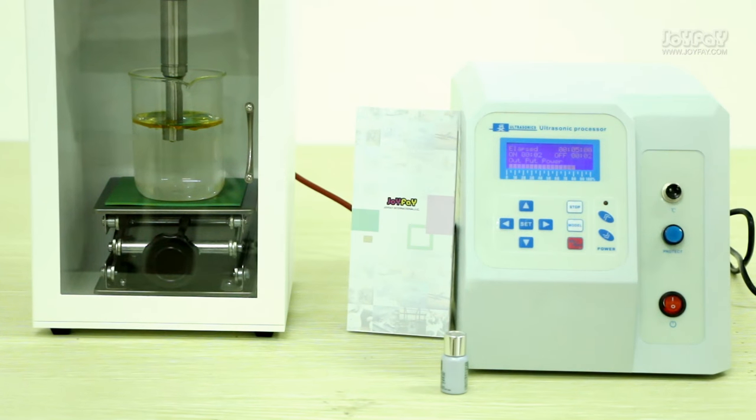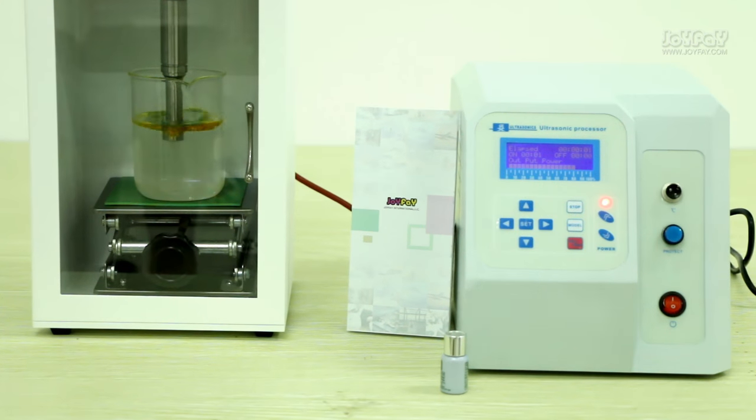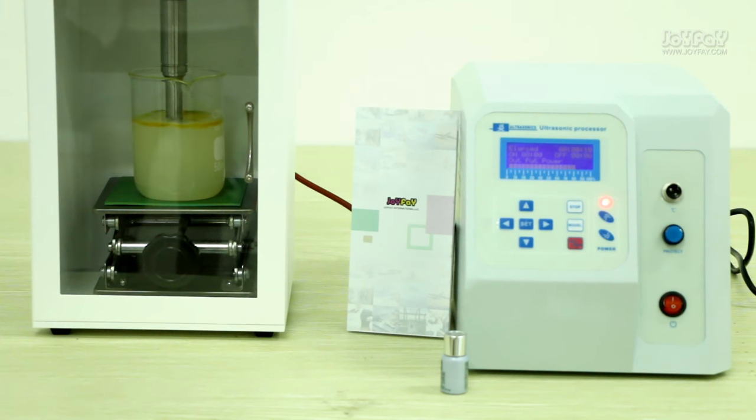Press the on or off button to turn on the machine and begin operation.